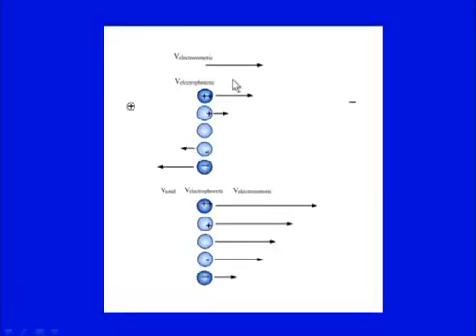Now, when you have electroosmotic flow, what is the movement of the charged species under this influence? If you see in this figure, the velocity of electroosmotic flow, how these charged species move, there is a comparison here. The more positive the charge, the more rapidly it will move towards the cathode, and the less the charge, the less it will move. So, it is a relative migration depending on the charge being carried by the species. Likewise, neutral species will just move through, but not as rapidly as the positively charged species. Then negatively charged species will experience electroosmotic flow, but will move towards the other side, that is towards the anode, depending on how much charge it carries.